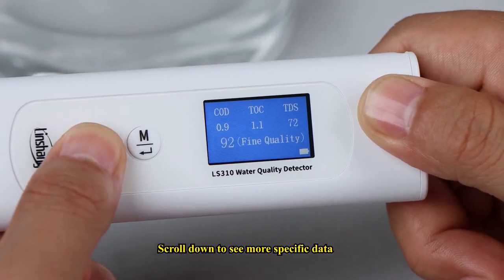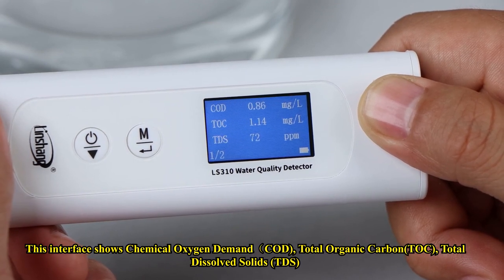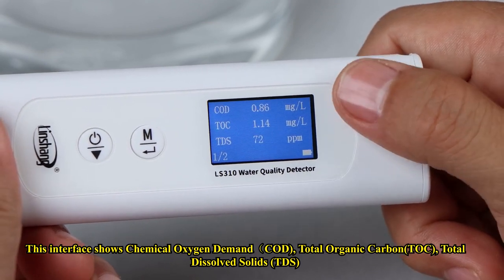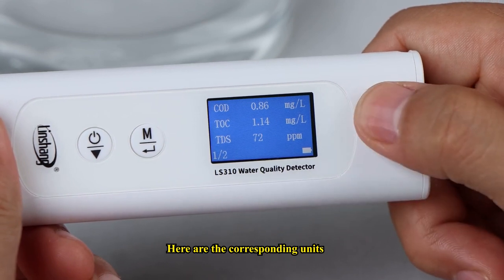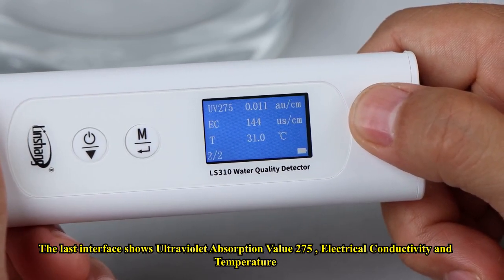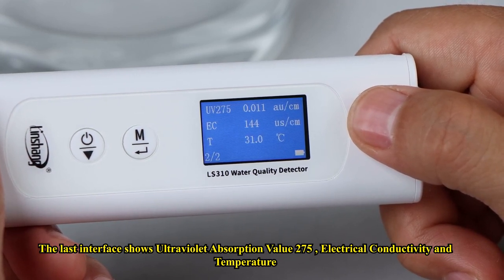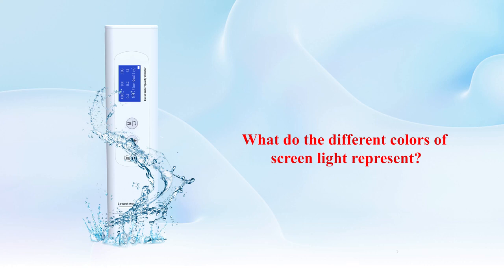Scroll down to see more specific data. One interface shows chemical oxygen demand (COD), total organic carbon (TOC), and total dissolved solids (TDS), along with their corresponding units. The last interface shows ultraviolet absorption value UV-275, electrical conductivity, and temperature.